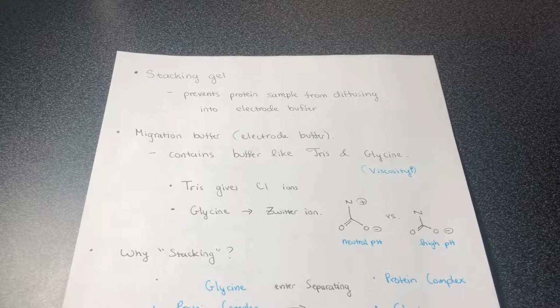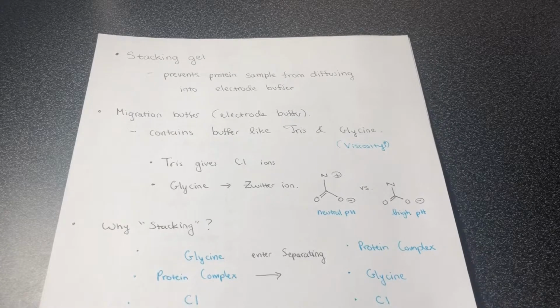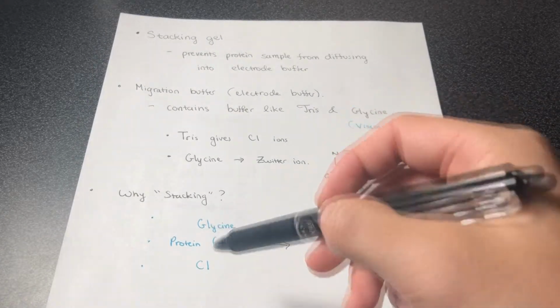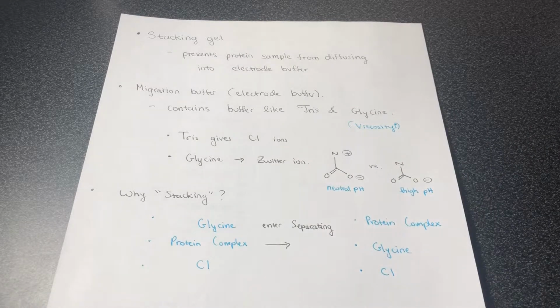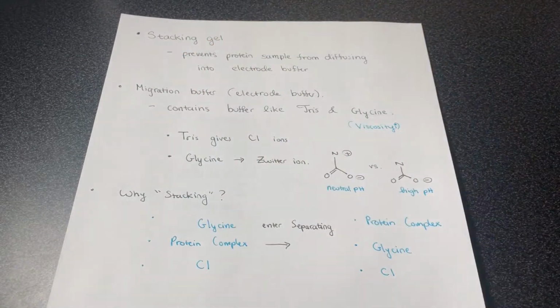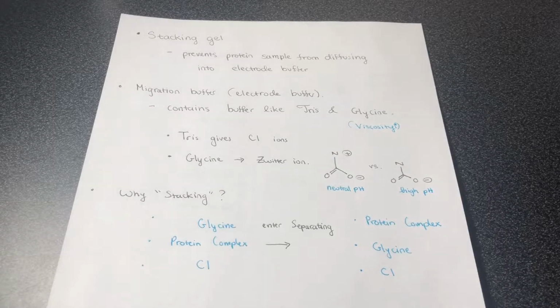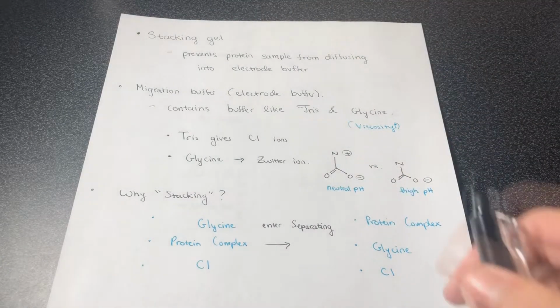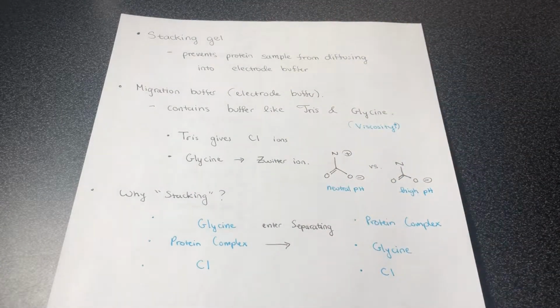So why stacking? Why was it important for me to mention all this? Well, when you look inside the stacking gel, you're going to find that chloride goes down first. The chlorine atoms go down. And the protein complexes come thereafter, followed by glycine. And it creates a stacking. So Cl and then protein on top and then glycine on top. Stacking. Then when you enter the separating gel, you're going to see that the glycine switches position to be in front of the protein complex.